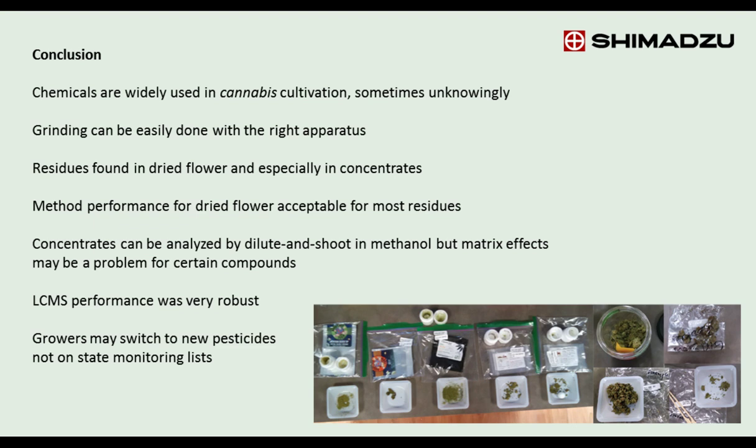And depending on the state's rules, the sample might range from 10 or 20 grams, for example. And from that larger sample, we would then select an even smaller subsample. So in the presentation, we used a 1-gram sample for the pesticide analysis. In principle, there's nothing stopping us from using a smaller sample because the instruments are able to detect pesticides from a smaller amount. However, to get good representativeness, typically we would use a 1-gram subsample.